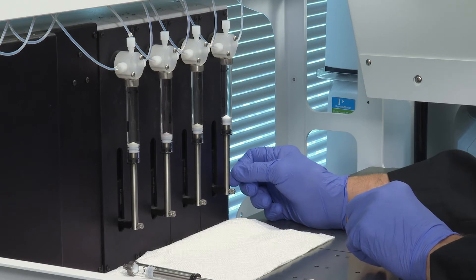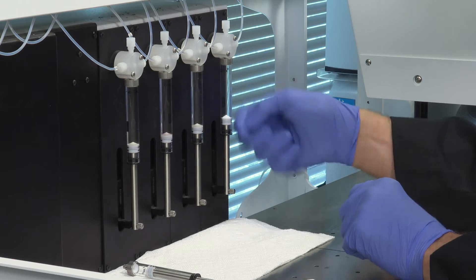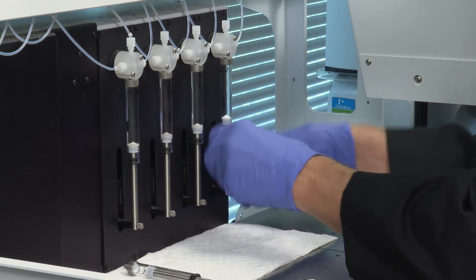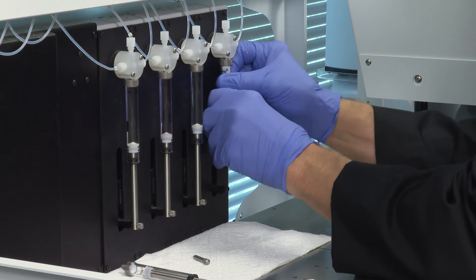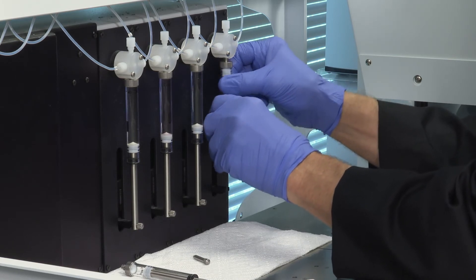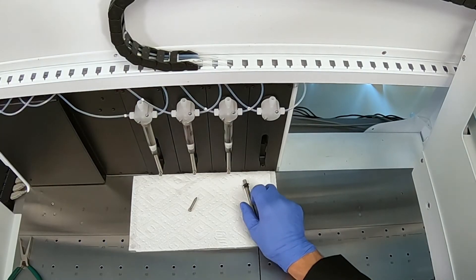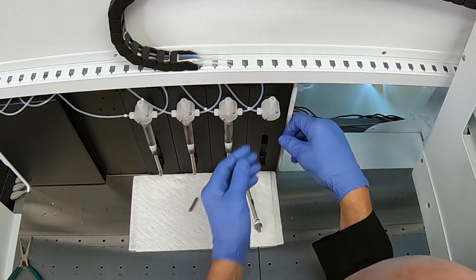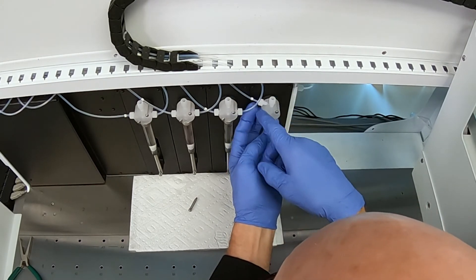With some systems, especially those that run dilutions, the four-port valve can be an issue. If that's the case, follow the same procedure for removing the syringe. Then loosen the fittings on the side for the system fluid lines that go into the four-port valve. Leave the plug in the top of the four-port valve to help with orientation later on.